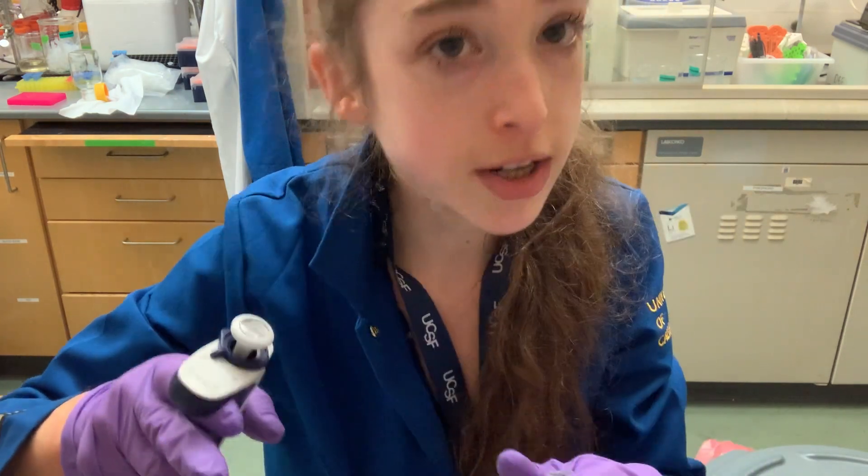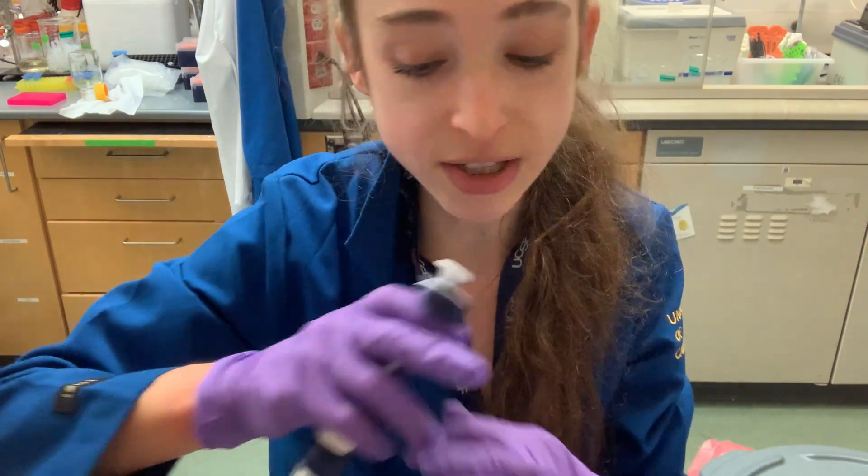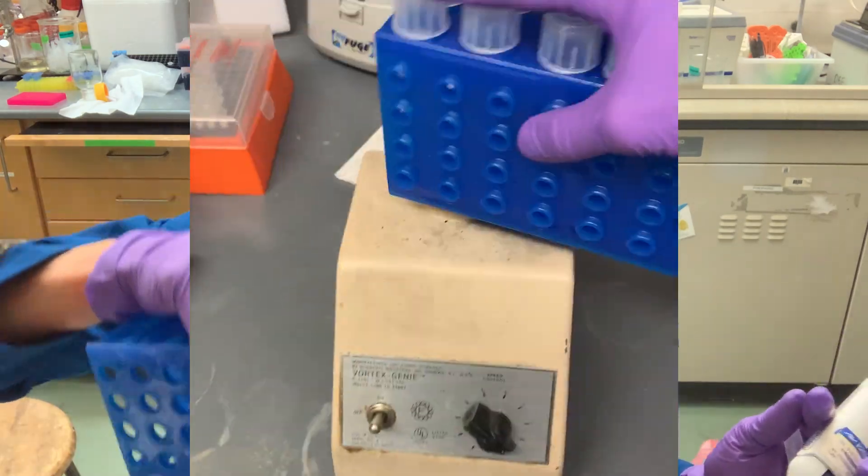When you're doing all of this, try to minimize bubble formation, and be sure that if you're using a vortex, you have your hand tightly over the top.